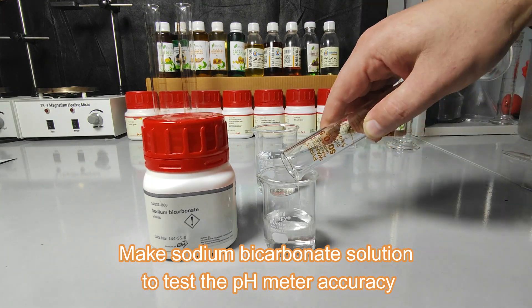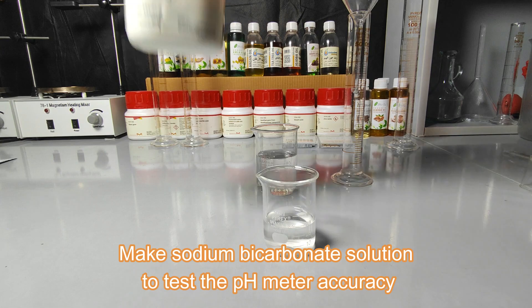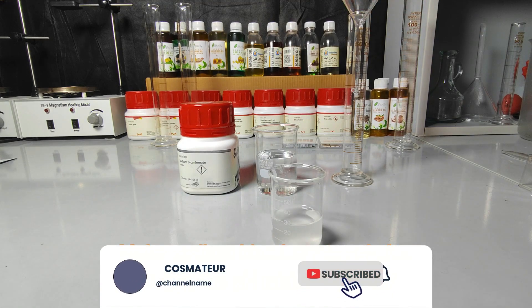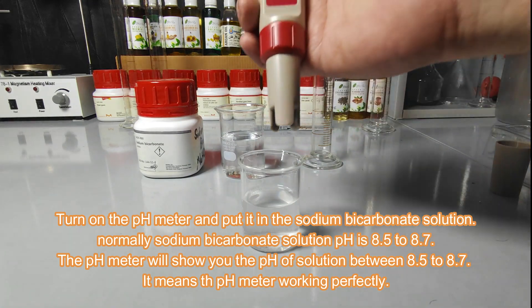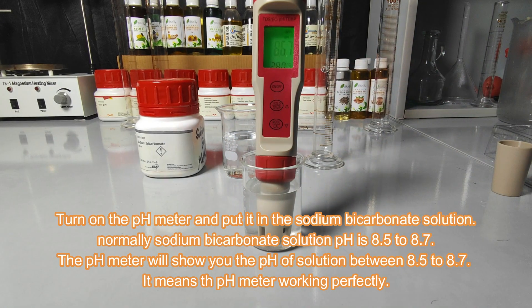Now take 100 milliliters of distilled water in a beaker, put 1 spoon of sodium bicarbonate in the beaker, and stir with a glass rod to make a sodium bicarbonate solution. Turn on the pH meter and put it in the sodium bicarbonate solution. Normally the pH of sodium bicarbonate solution is 8.5 to 8.7, and the pH meter display will show you the pH of the solution.